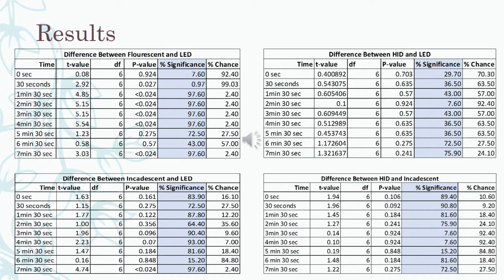With a confidence interval of 95%, my t-tests revealed that the differences between the rates of photosynthesis were not significant between LED, HID, and incandescent light sources. Chloroplasts exposed to fluorescent bulbs are significantly different than the other three throughout the reaction, though the total time of the reactions did not differ by much. Two other fluorescent tables are not shown here because the results are similar.